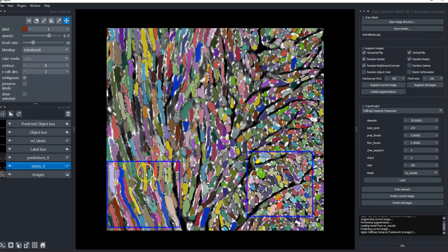So when I draw the labels, I'm not taking as much care as someone who is invested in the project. So I might do these labels in like 20 minutes, while if you're labeling for a model that you want to use for your research, you should be taking days with very careful labeling, labeling multiple images and everything to get really solid labels.